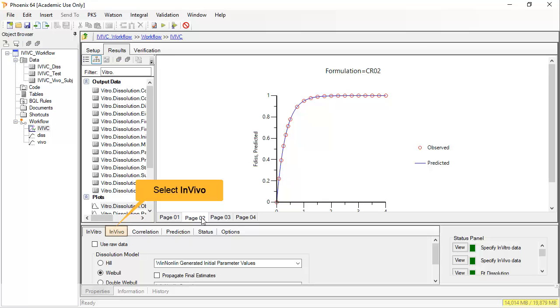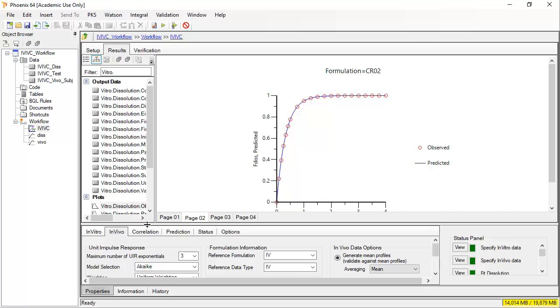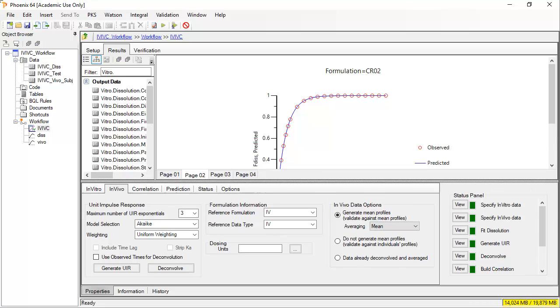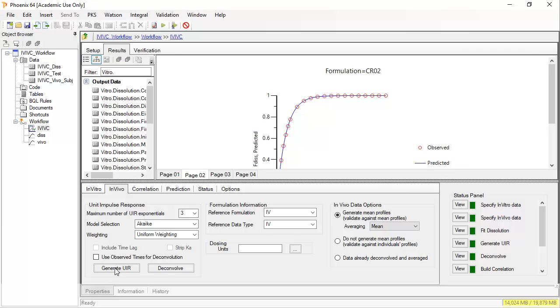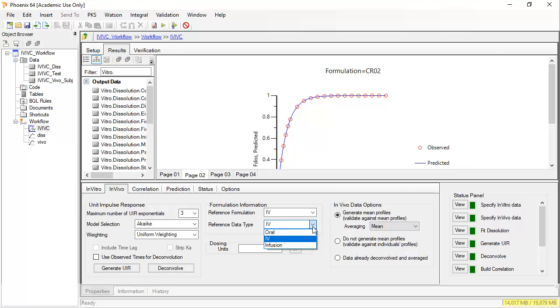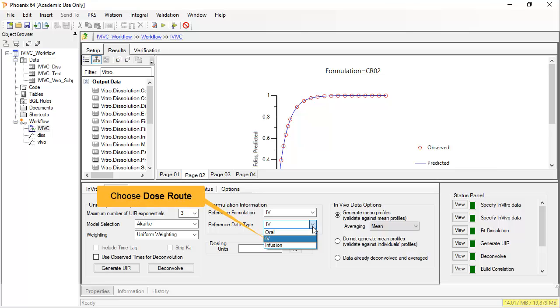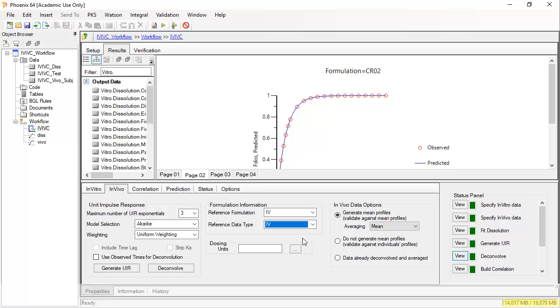Let's move to the in vivo tab. On this tab, the unit impulse response is generated. That is, the elimination of the drug is described, ideally from an intravenous reference. Once the UIR is defined, we can deconvolve the other extravascular formulations.